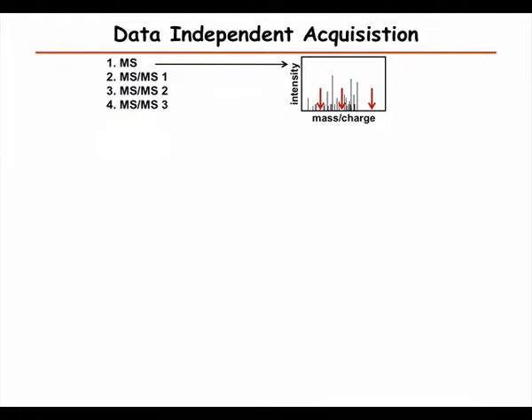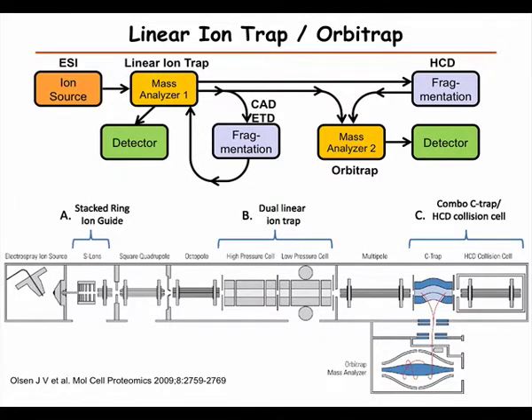So then, I have a real world question about this. Suppose you have something that you want to do a mass spec about, and you go to a core in order to get the mass spec done. Is it worthwhile for the person to know upfront what sort of a setup is there in the core because of all these differences?